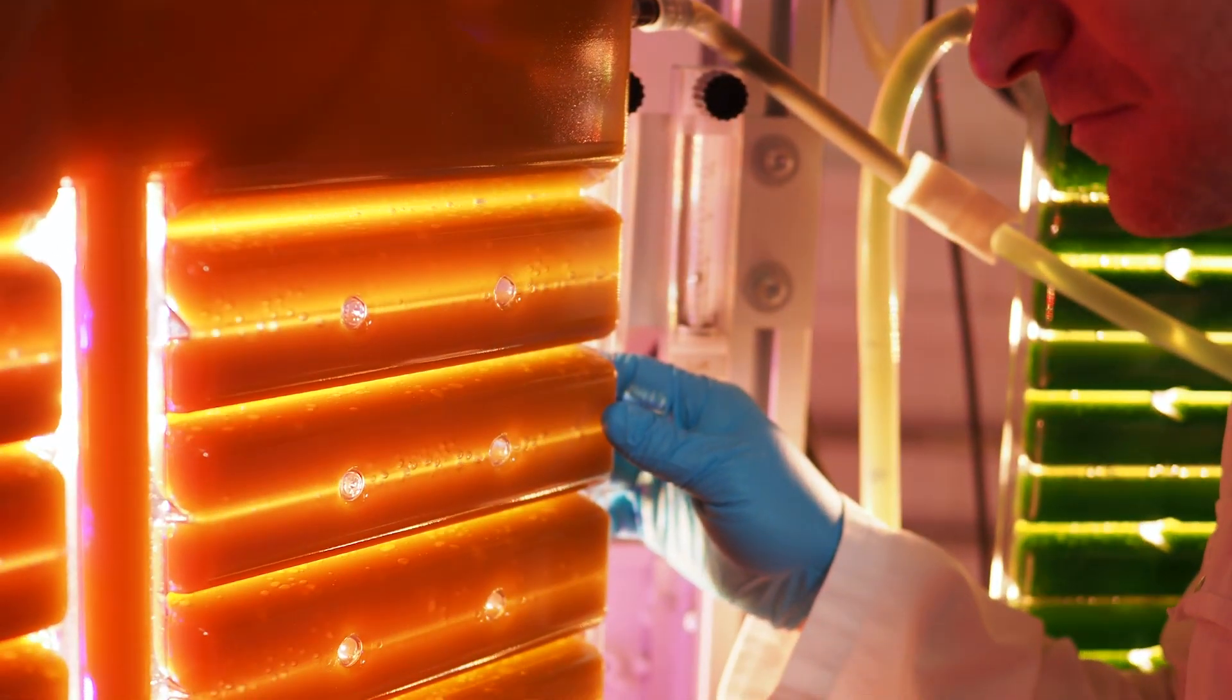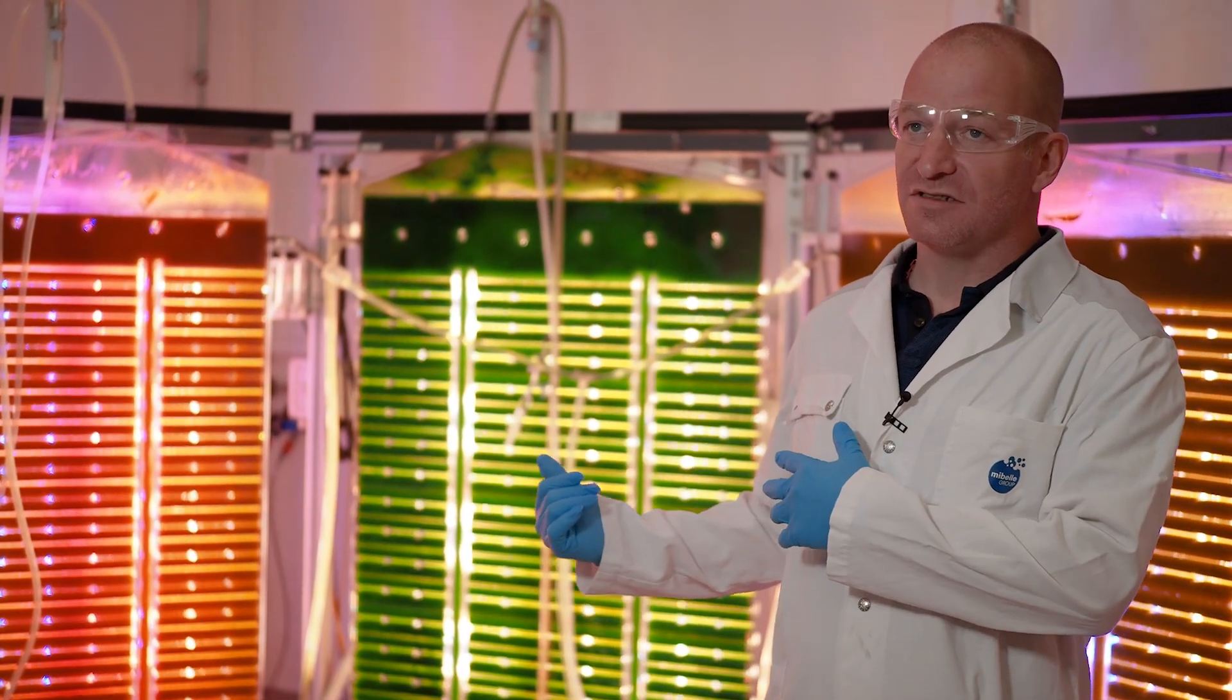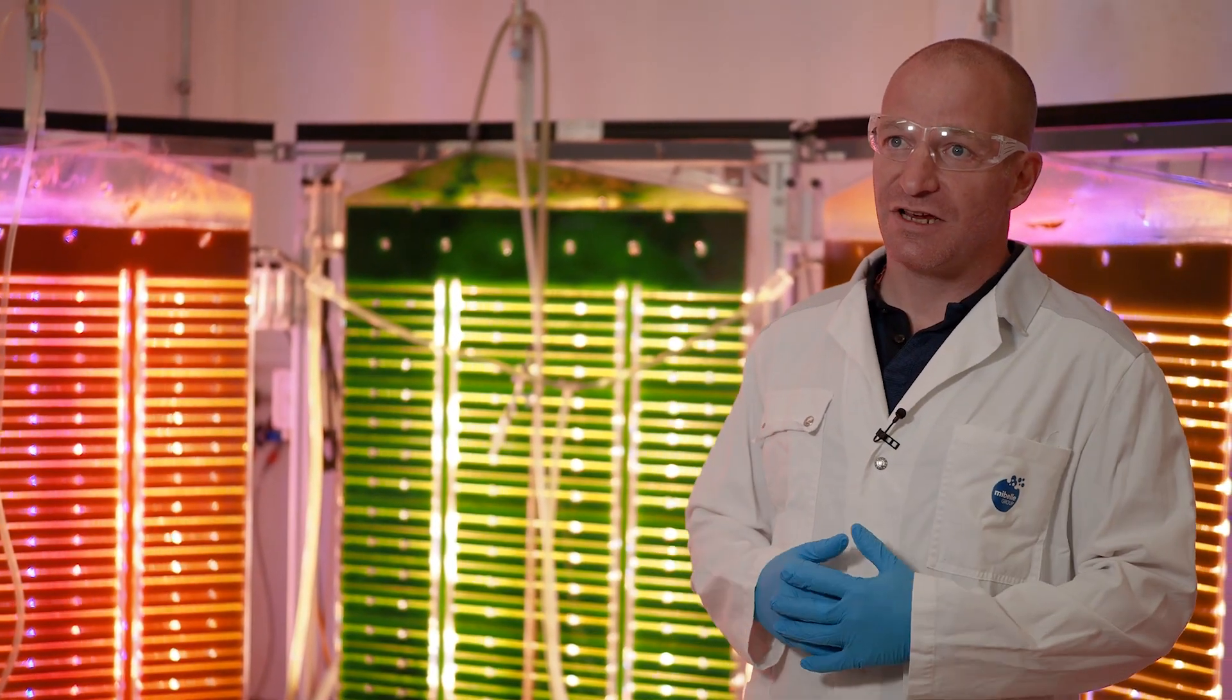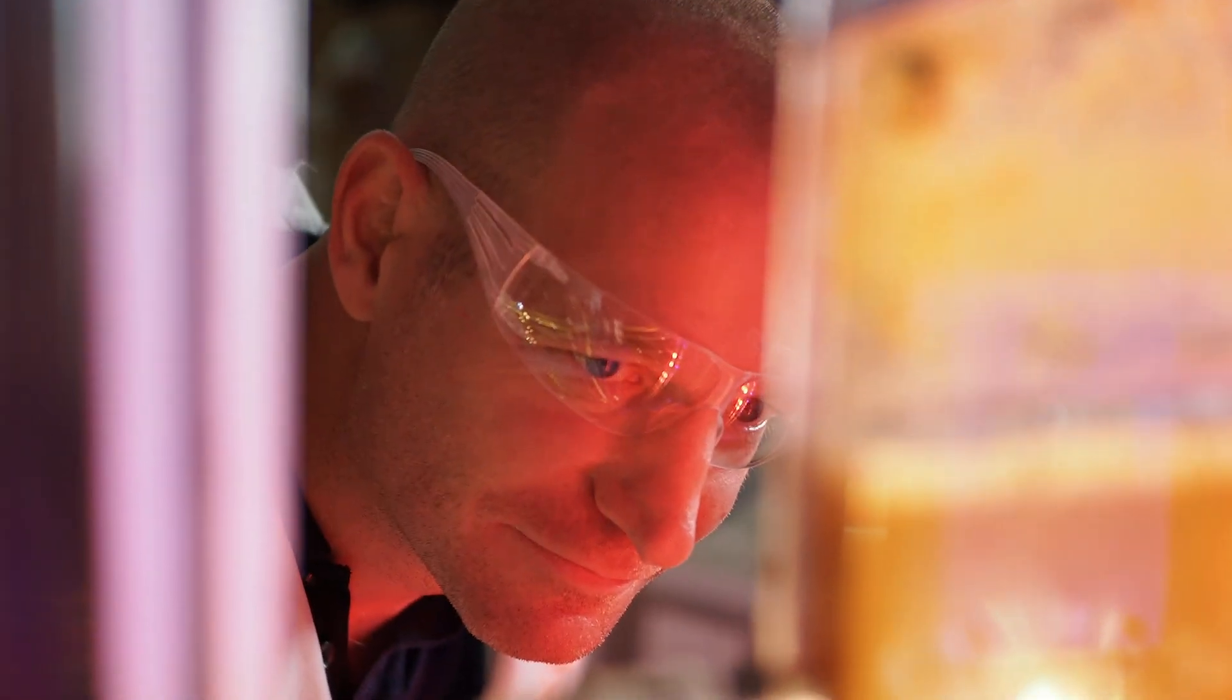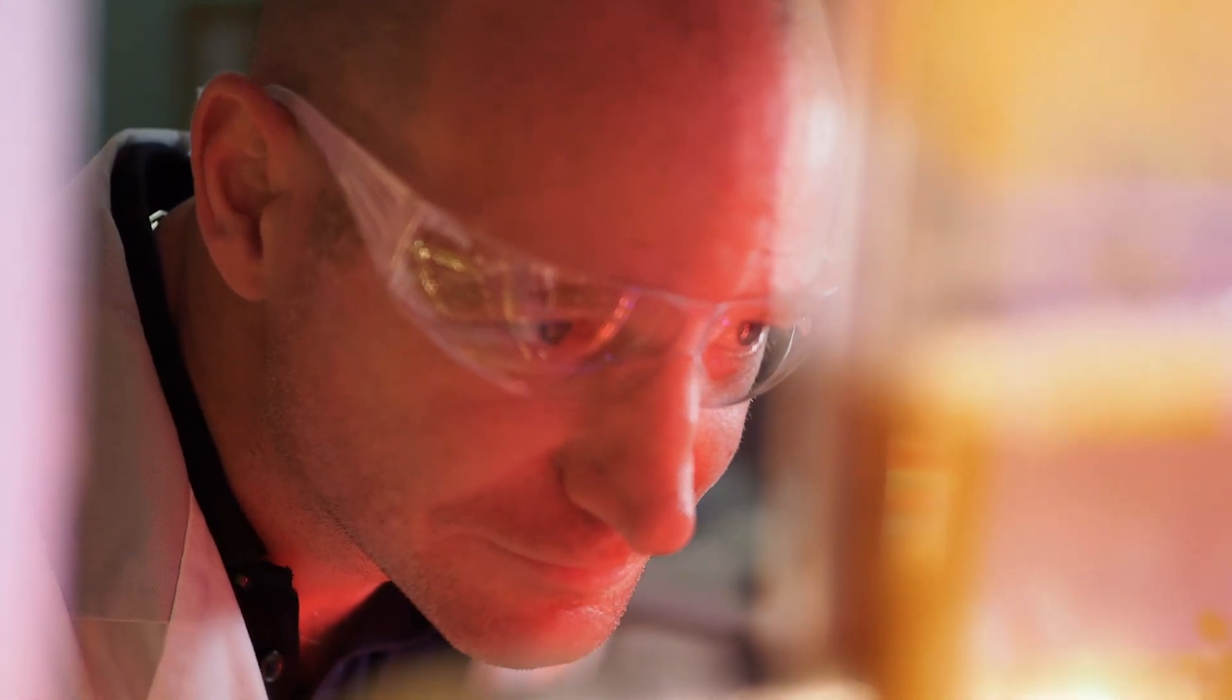We are simulating nature in this room where we simulate the springtime in the green bioreactor. Once they are grown, we transfer them to another bioreactor where they get more UV radiation.